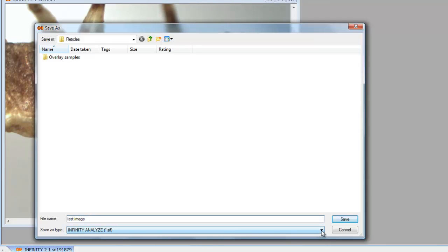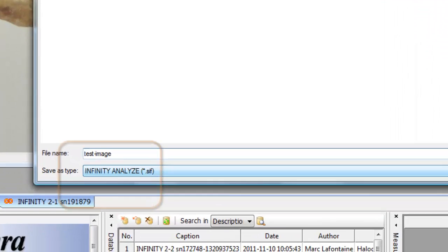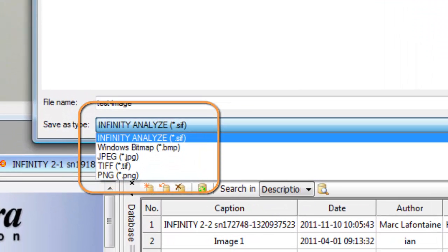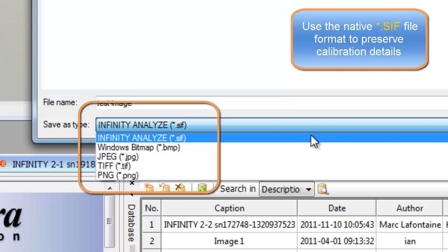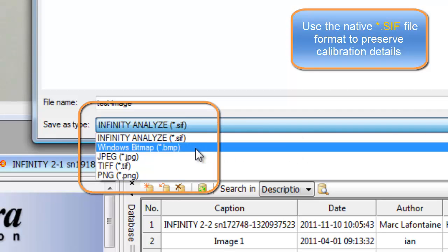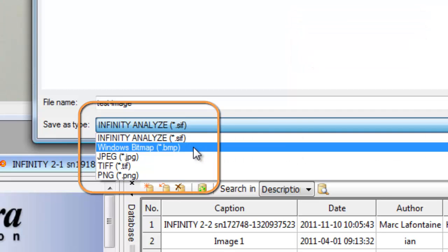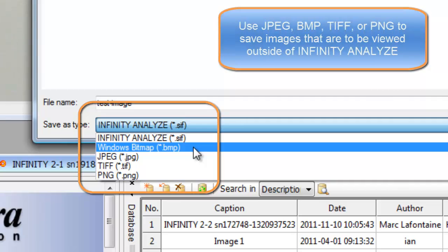The file types to choose from include Infinity Analyze's native SIF format. As described in previous videos, the SIF file format is the only file format which can retain the calibration data along with an image. So if you want to open an image later and take additional measurements from it using the same calibration, you must save the images in the SIF file format.